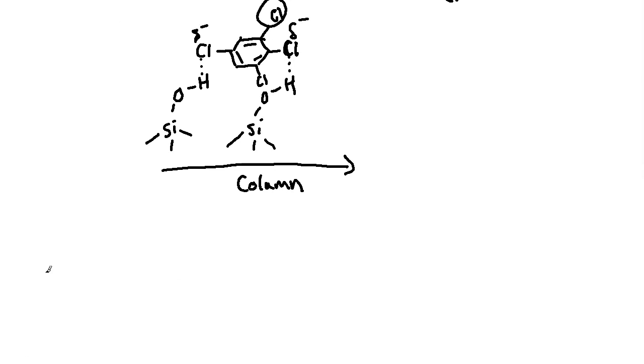So then finally, what we're going to do here is wrap up, because we're going on about half an hour for this one, and we're going to talk about some of the pros and the cons. So now that we know the groundwork for normal HPLC, how it works at the molecular level, and when it might be appropriate to use, we're going to wrap up the lesson with a compare and contrast regarding the advantages and disadvantages. So let's consider all of the advantages for a moment, and then we will talk about some of the drawbacks that could come with that, doing a pros and cons list.